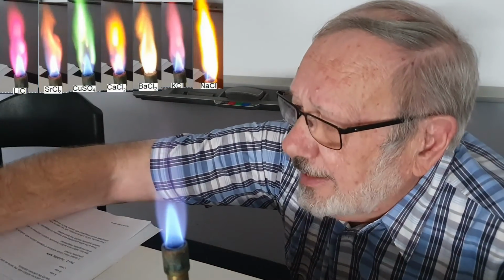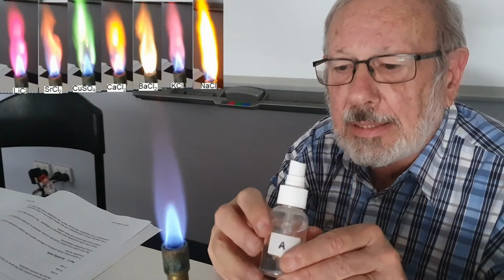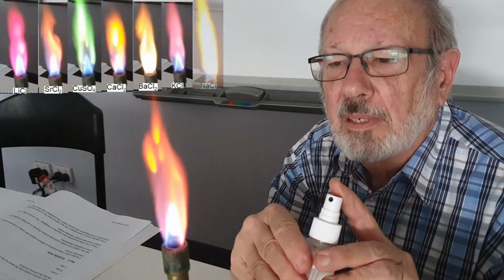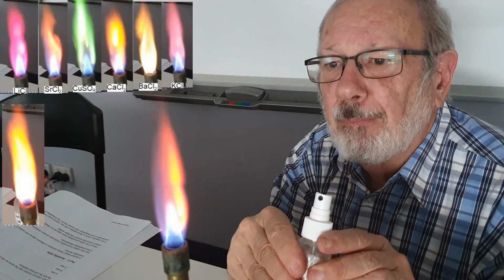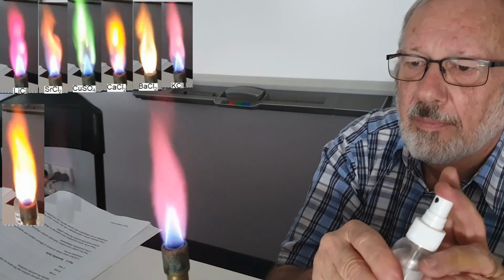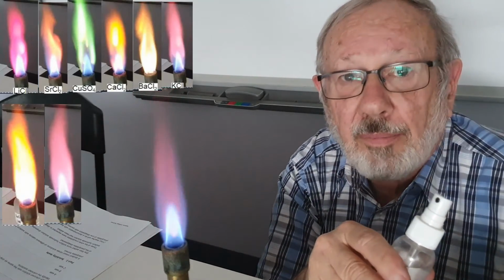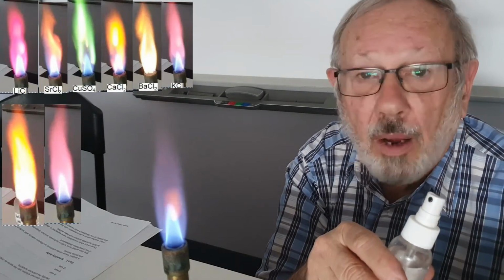Our next task is to record the unknowns. So I've got here unknown A. Let's see what colour that brings. Let's try unknown B. Wow, that looks pretty clear, doesn't it? That's our violet, our indigo, our purple one.